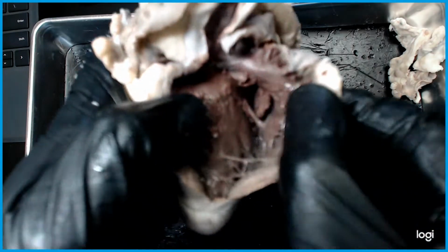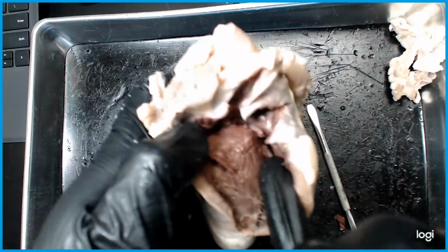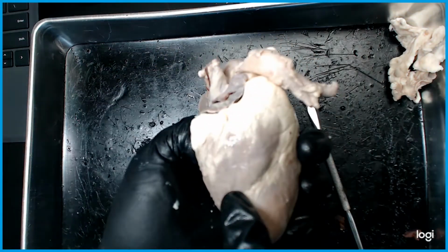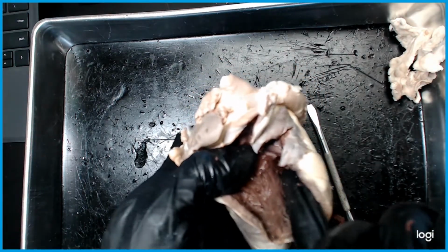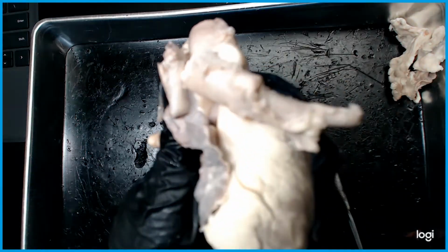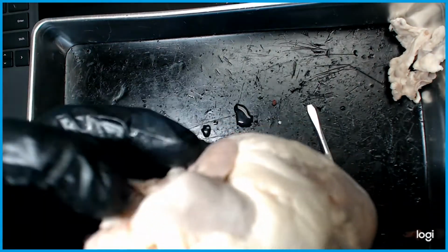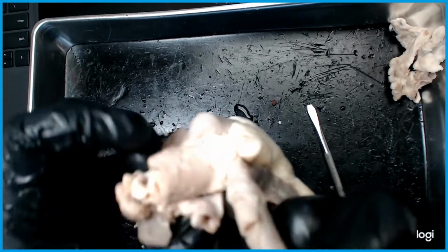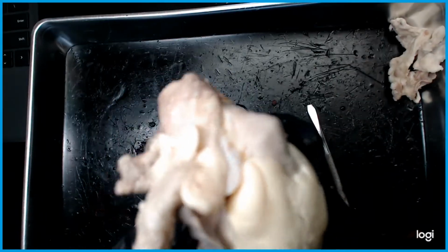So here, what we're going to do is you find it. There's no other opening other than coming towards the back. If you really follow it, here's the septum. We talked about the septum being here in the middle. We follow it through the back, and you can put your finger through. Don't be afraid to push your finger through. Eventually, as my finger's in there, that's my finger right there, I know that that will lead me to the pulmonary trunk, which would be the pulmonary arteries.